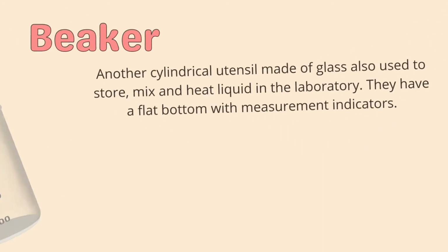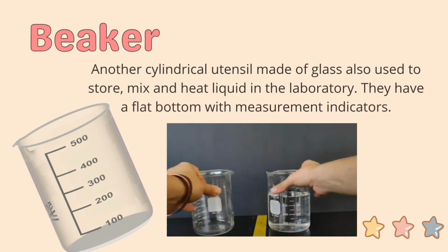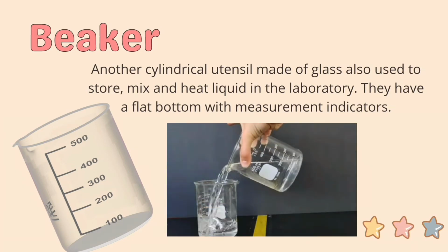Now we have here another cylindrical utensil made of glass, the beaker, which is also used to store, mix, and heat liquid in the laboratory. They have a flat bottom like a typical glass with measurement indicators.